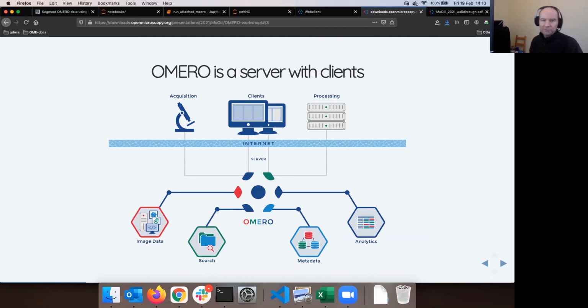What are responsibilities of the Ome team? And what can Omero do for you? Okay, because these are the questions which we think we always explore, but for some time there is always this thing that Omero sometimes doesn't fit into mental model of scientists. So let's go through that a little bit again.